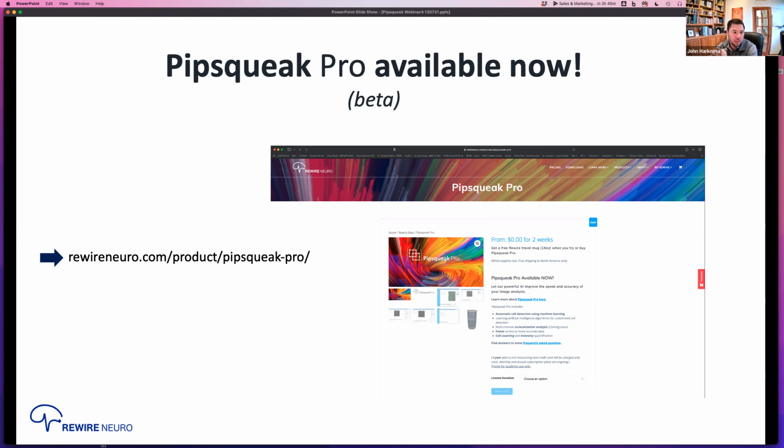It would be pretty hard to determine that outside of this. So that's something that you can still include. That is not in the beta of Pro right now, but will be before the full release. Otherwise, the area of an image right now is just included as pixel area.